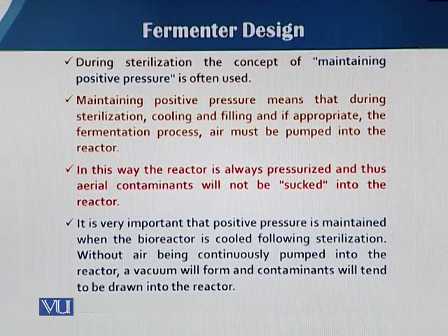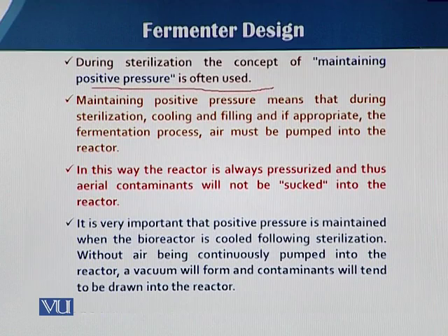So during sterilization, there is the concept of maintaining positive pressure. If all the time during the fermentation process we keep the pressure positive inside the fermentation vessel, that means that during sterilization, cooling and filling, and if appropriate the fermentation process, air must be pumped into the reactor.